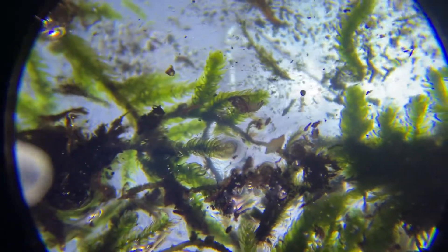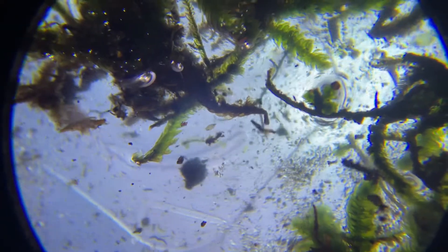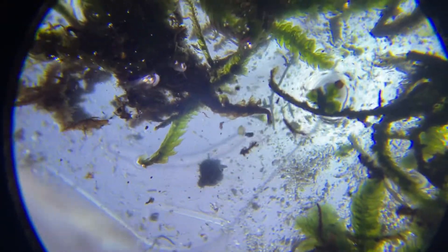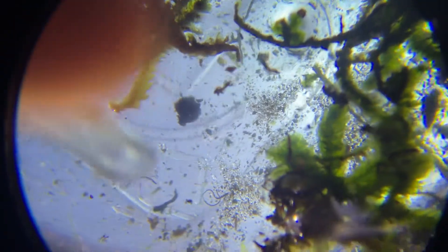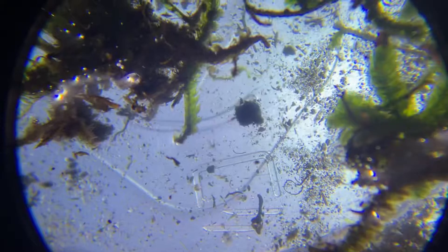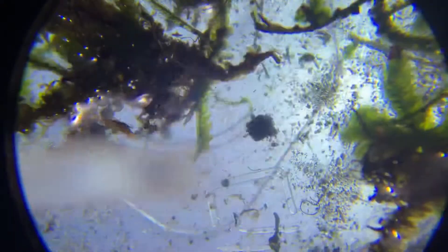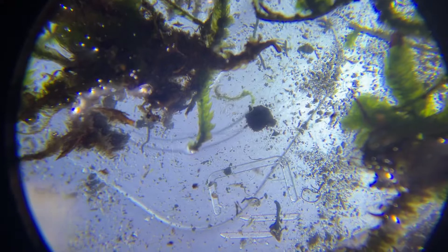I'm going to get another sample and continue looking. When I find one, I'll leave it in here, put the camera back on and show you how to capture it. To capture one, you focus in on it — let's pretend that little thing right there is the tardigrade. You get your pipette ready, and you do this and suck it in. I just got that in here, and that's how you do it — then you bring it over to a regular slide.